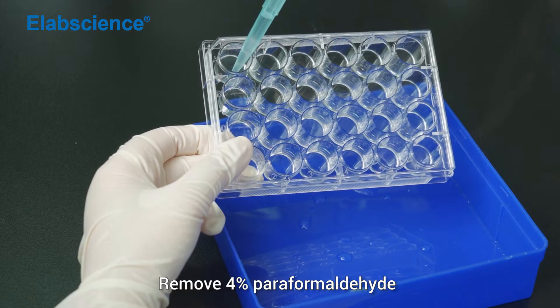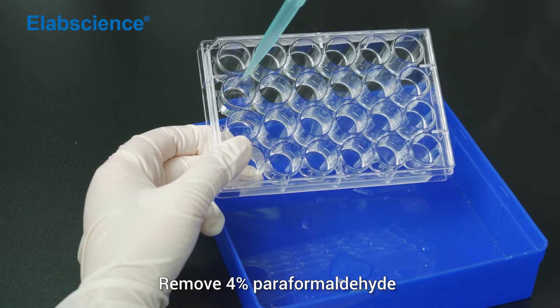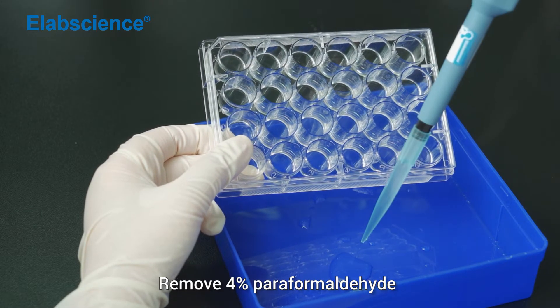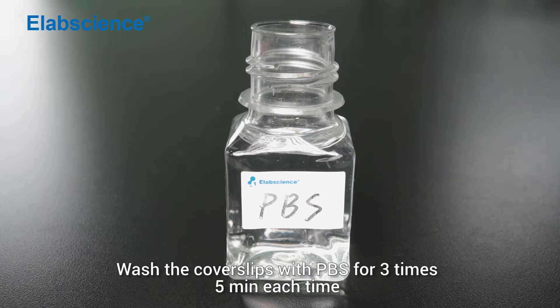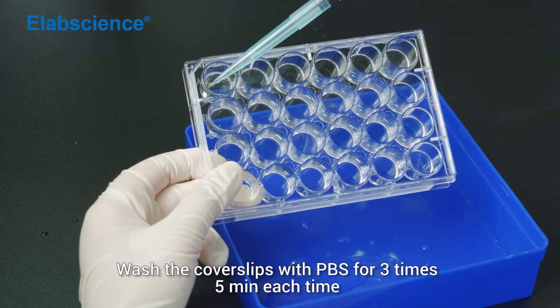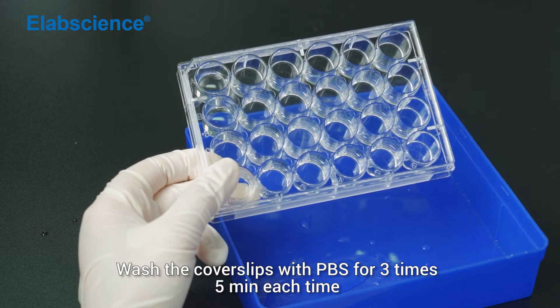Remove 4% paraformaldehyde. Wash the cover slip with PBS for 3 times, 5 minutes each time.